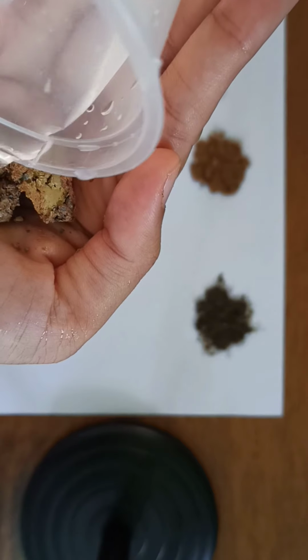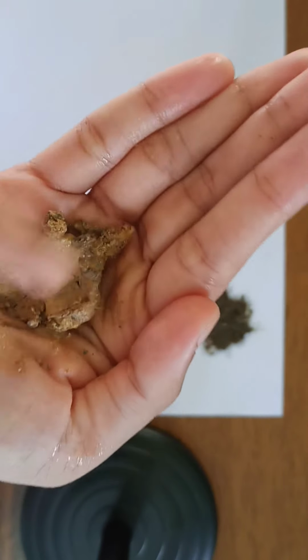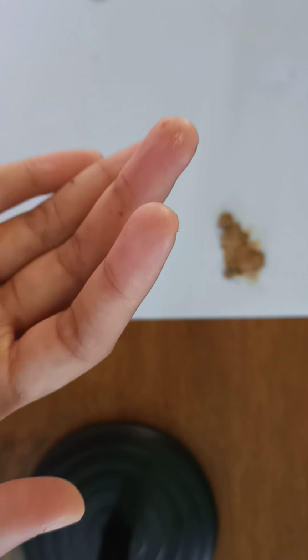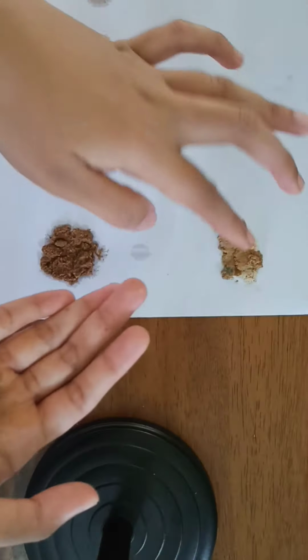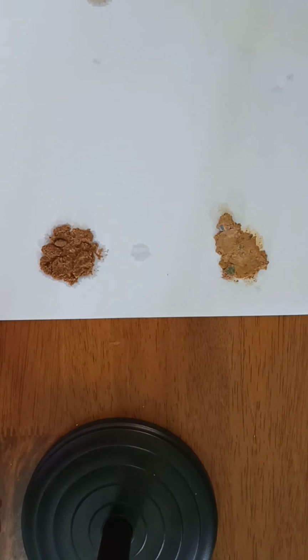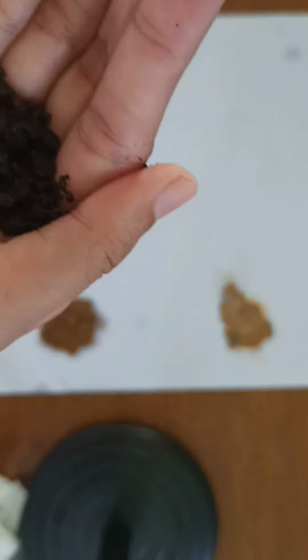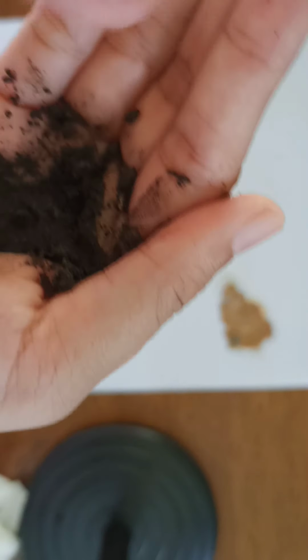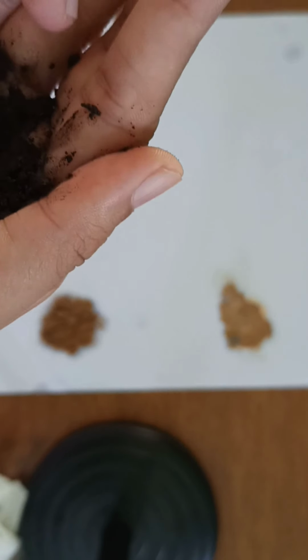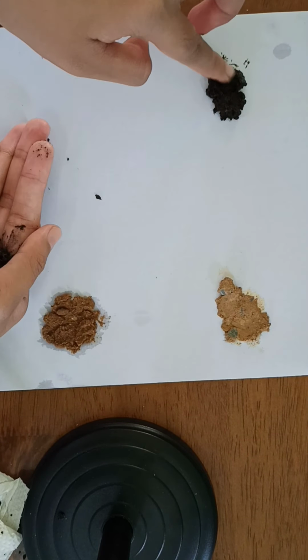We add a little bit of water to make a paste. Okay, then smear on a piece of paper. This is sample 4, so we are going to put a little bit of water to make a paste, and smear it on a piece of paper.